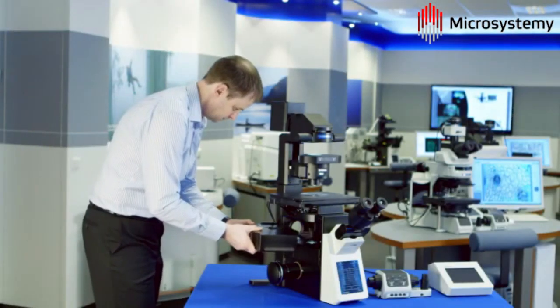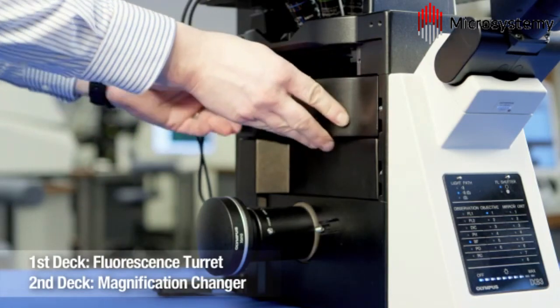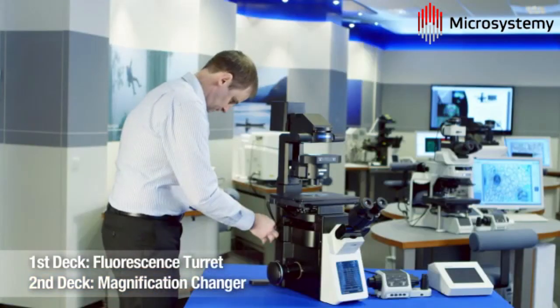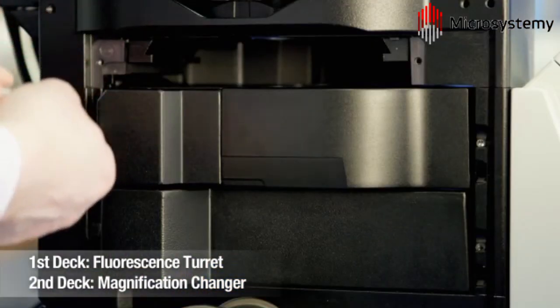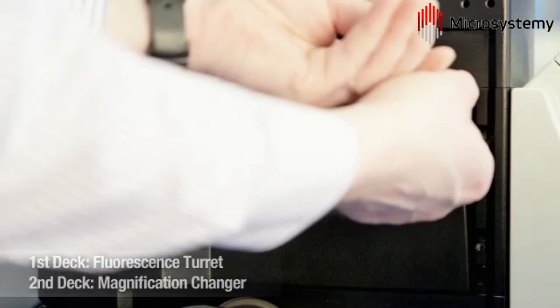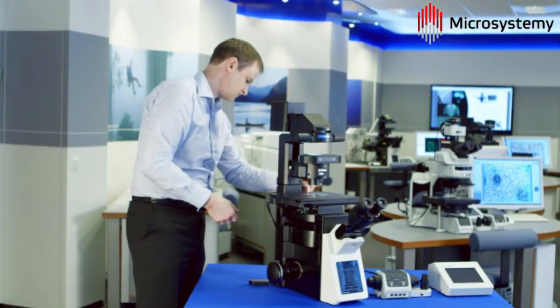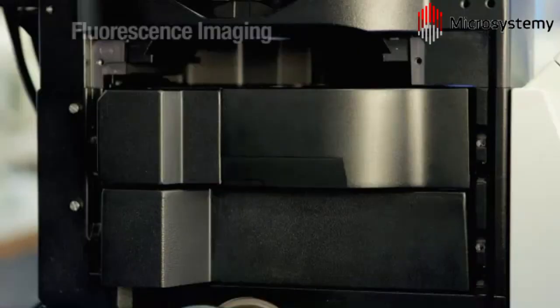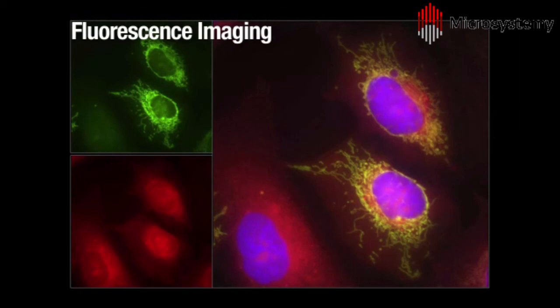Fluorescence imaging is possible with the inclusion of the filter turret module. The external light source is connected via the rear port and up to 8 filter positions are available. The optical path has also been enhanced to include extra-large mirrors, increasing the field of view. Capture of HeLa cells stained for imaging of mitochondria and endoplasmic reticulum is achieved here using separate filter positions, merged to form a multi-channel image.